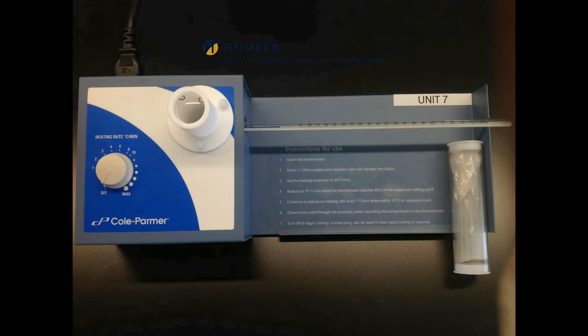Lower the heating rate as the expected melting point temperature approaches. Observe the sample through the magnifying lens located at the top of the unit until melt occurs. Read melt temperatures from the thermometer.